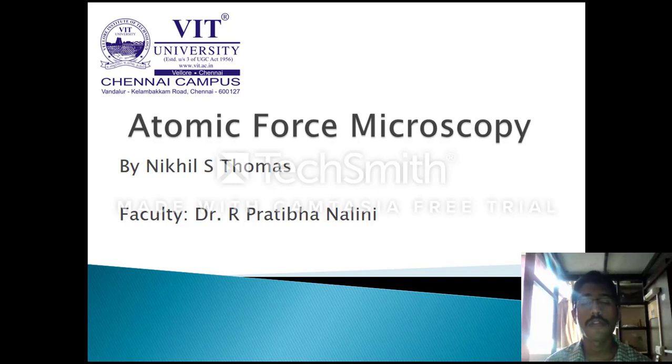Hi everyone. All of us know that there are many techniques for advanced material characterization. Some of them are XPS, Rutherford backscattering, and it keeps going on. I'm going to talk about atomic force microscopy, which is commonly known as AFM.